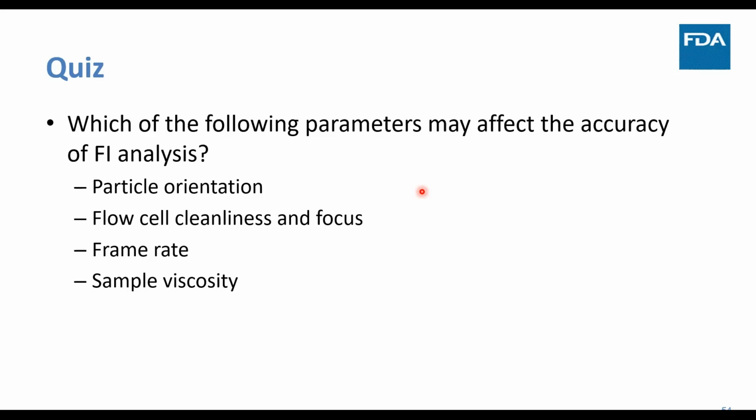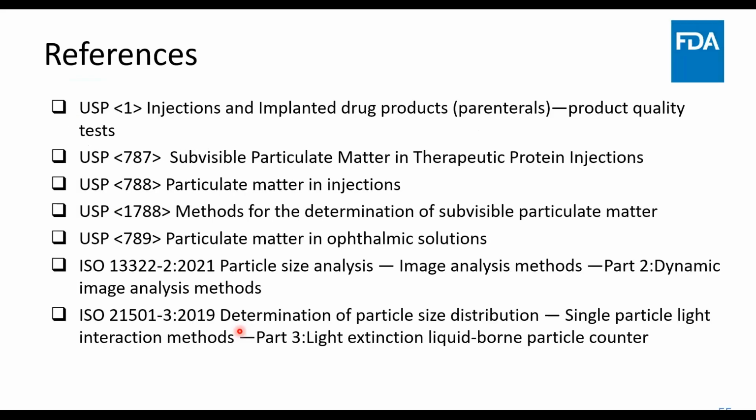Sample viscosity, we did talk about how it could impact your pump and the accuracy of the fluid you're moving through. And your frame rate would affect the efficiency, or how much of your sample you are actually analyzing. Thank you all for your answers. So these are the references, and I think I'll pause here and take any questions.